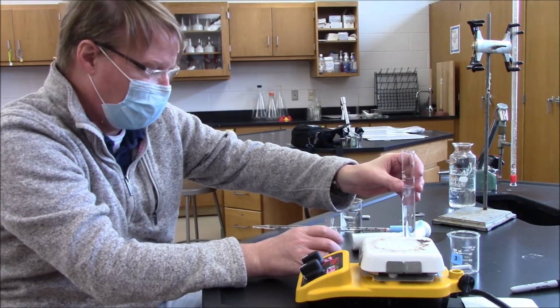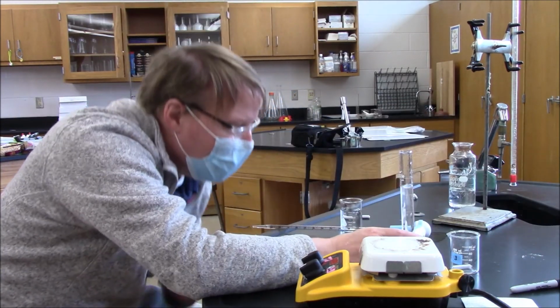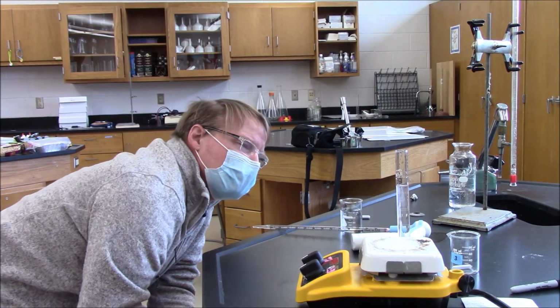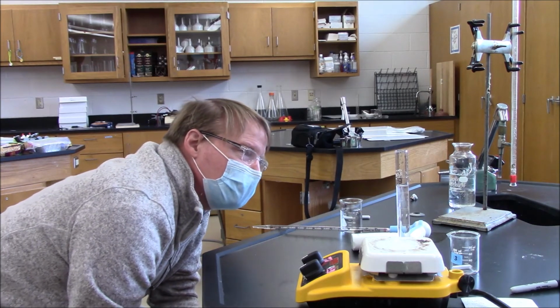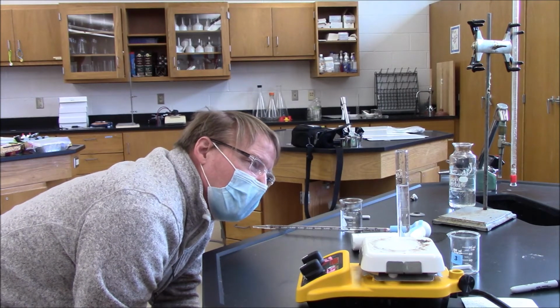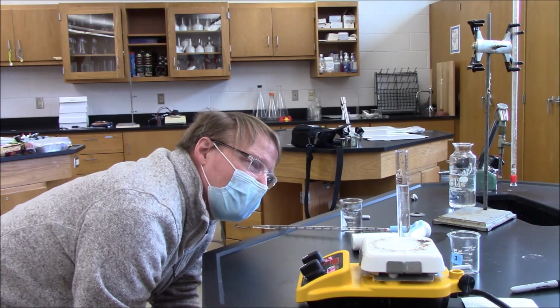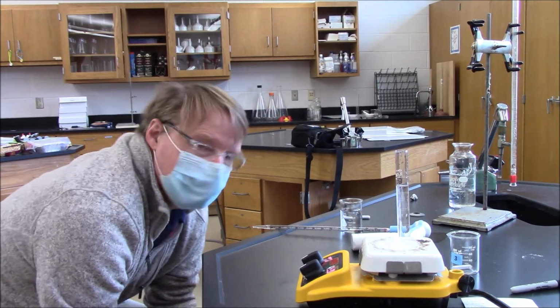Okay, go ahead, and you want to get down a little low so that you're at eye level. And what do you say the volume is? It says 45, what is that, milliliters? Okay, 45 milliliters. You think it's exact? It is not exact, it's a hair under 45. So go ahead and estimate what you think that would be. 44.8. Perfect. 44.8 milliliters is our volume.